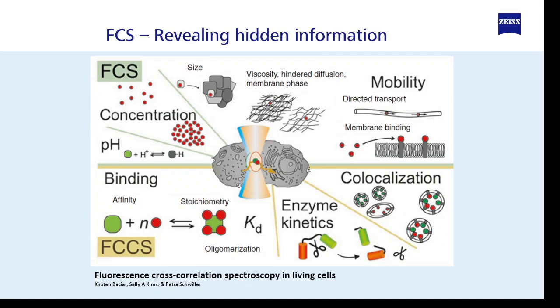On the other hand, this paper shows us that FCS is actually a good tool for revealing hidden information of the molecular dynamics.